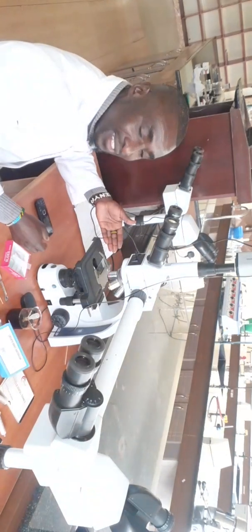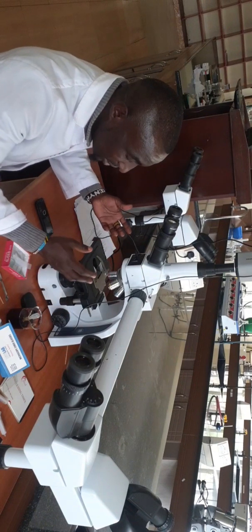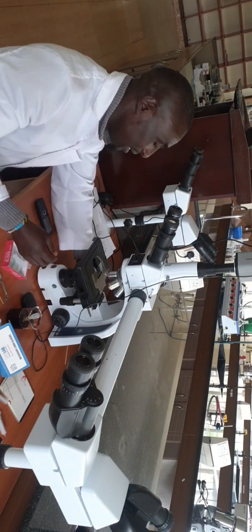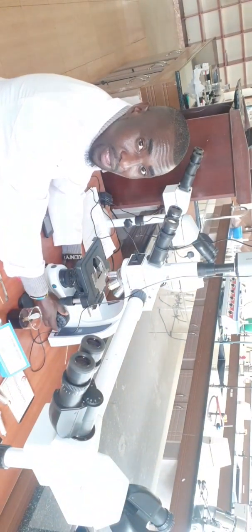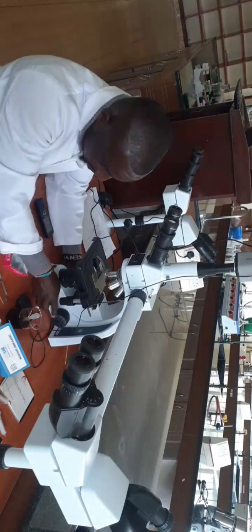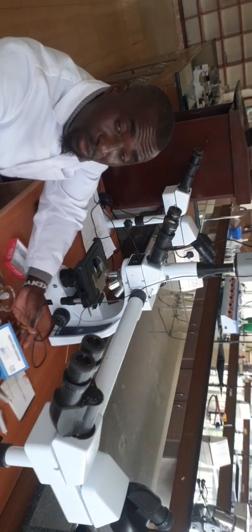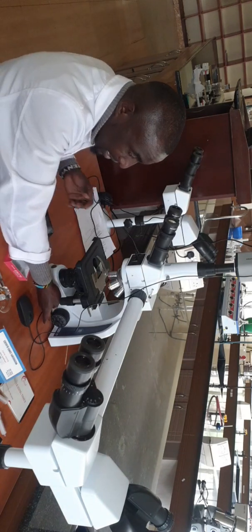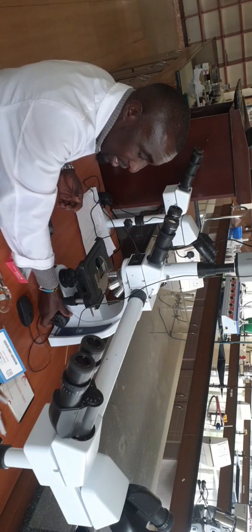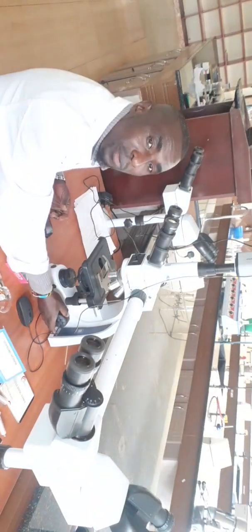Now, again, we have got the knobs, the coarse adjustment knob and the fine adjustment knob. So the coarse is here and the fine is here. Let me just show you clearly. The coarse knob ensures that the stage is moved upwards, to bring the specimen into primary focus.